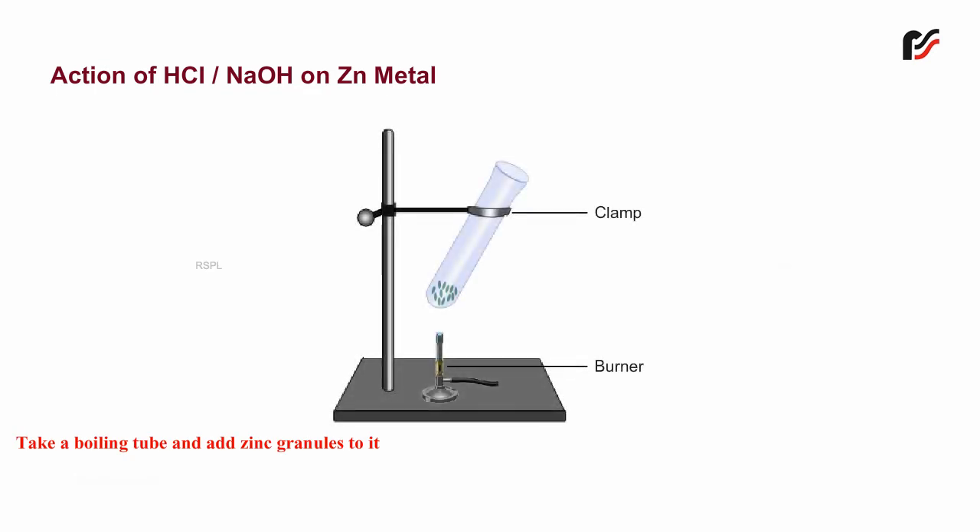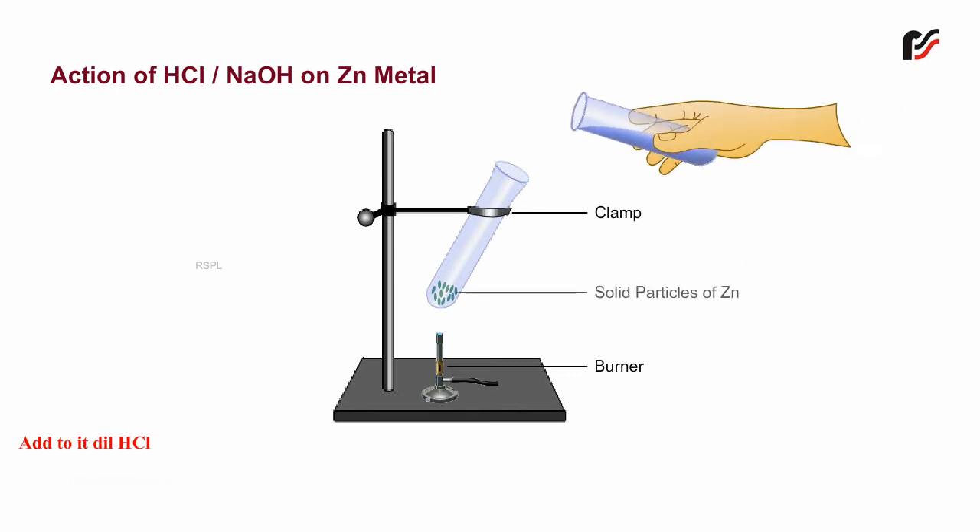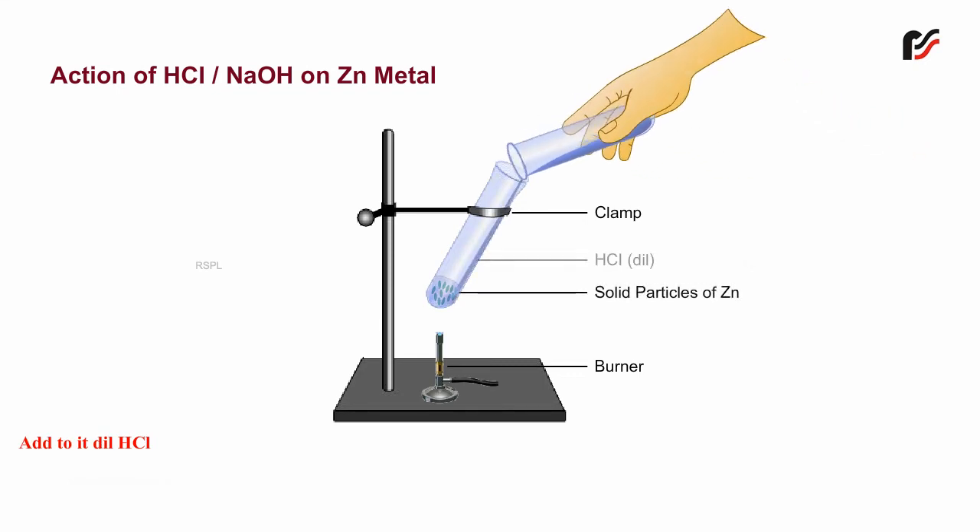Action of hydrochloric acid or sodium hydroxide on zinc metal. Take a boiling tube and add zinc granules to it. Add to it dilute hydrochloric acid.